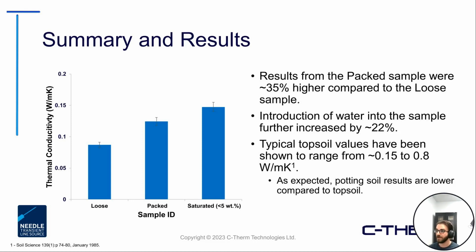We then took the packed sample, removed it, and saturated it with a small amount of water. This is very minimal, actually. I believe it's probably close to maybe 5% by weight here, just to partially saturate the sample. And then again, packed it all down and inserted the probe in, took some measurements. And then we saw a further increase by approximately 22% here. And again, this makes sense as to what you may expect.